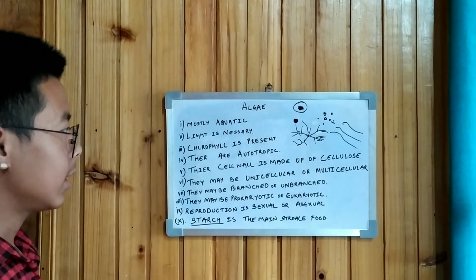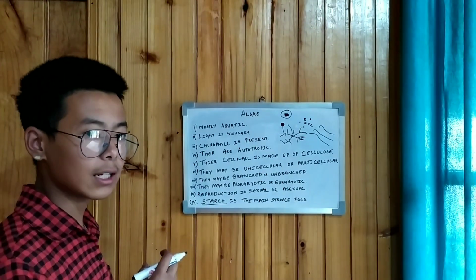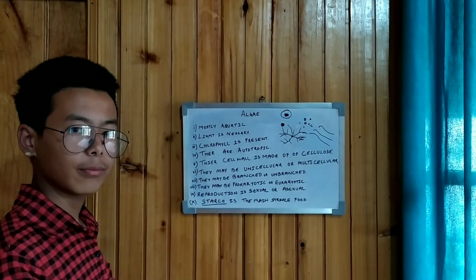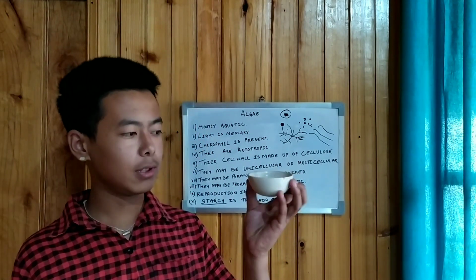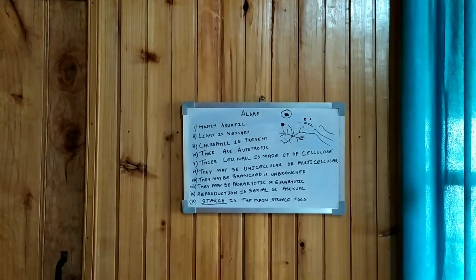Now we will be observing an algae sample collected from a pond under the microscope. I've brought a sample in a china dish. Please wait a second.